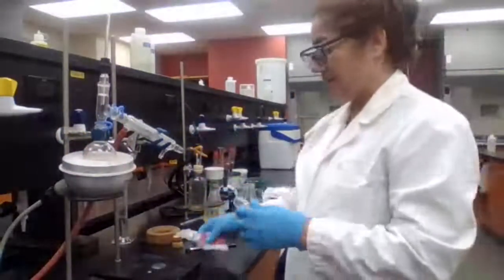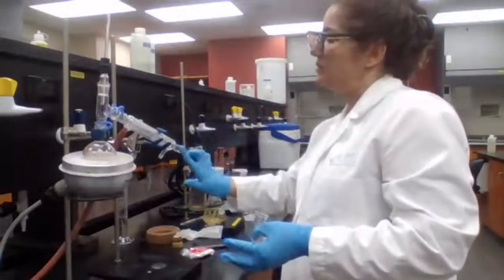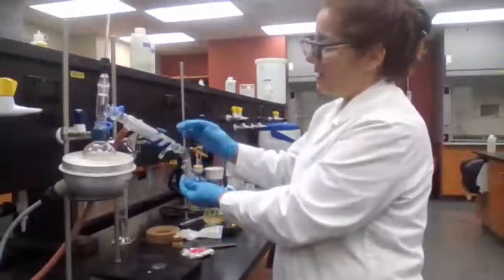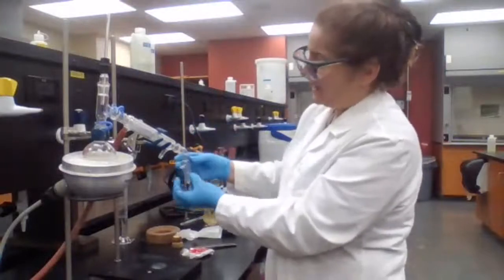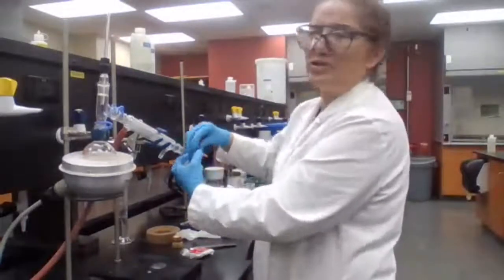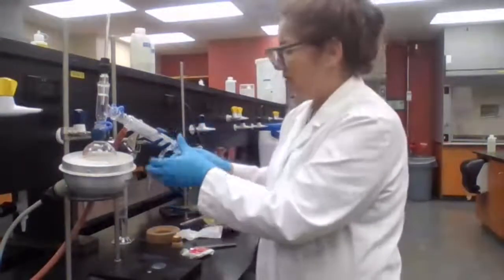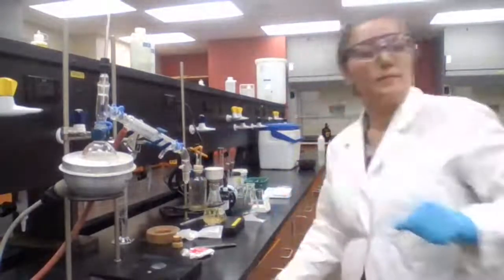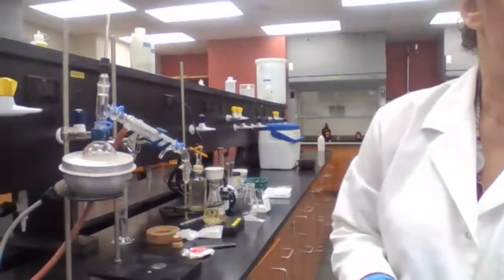And for collecting, to make sure that I'm not losing any of the vapor or the liquid, it's best to use a vacuum adapter. This one is a little bit longer, so the vapor doesn't escape and is more directed into the receiving container. What should I receive it in? In a flask, beaker, graduated cylinder, or another? Does it say or not?